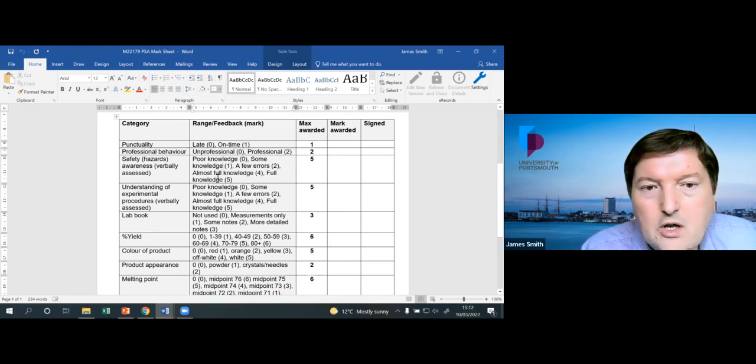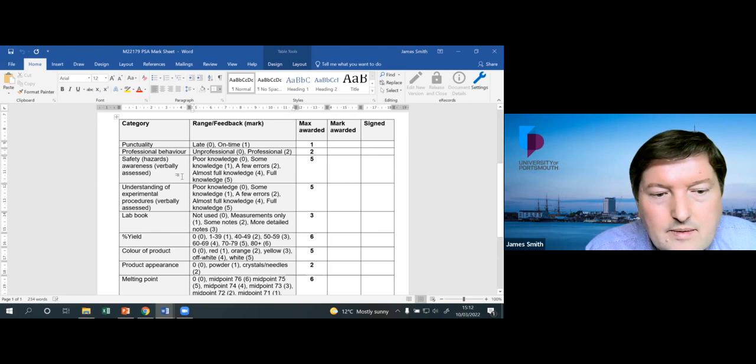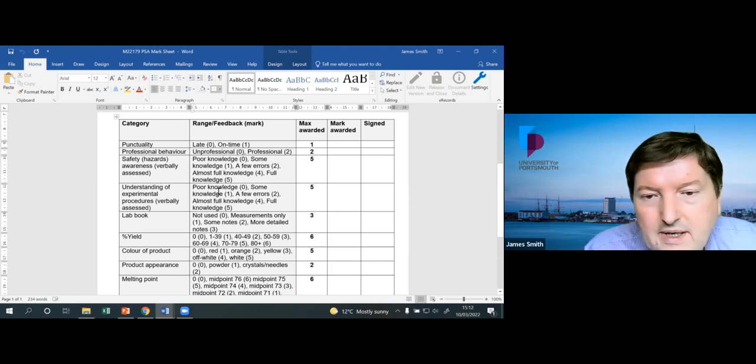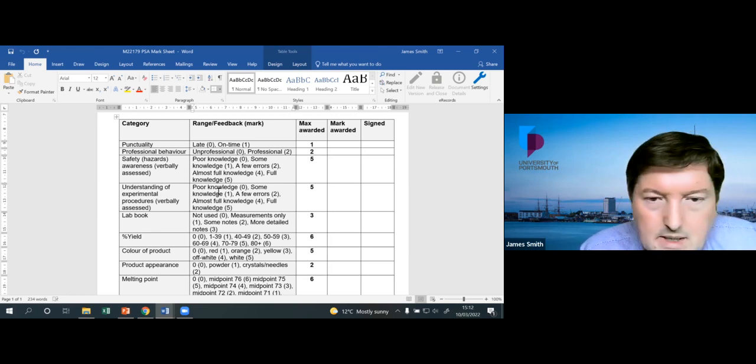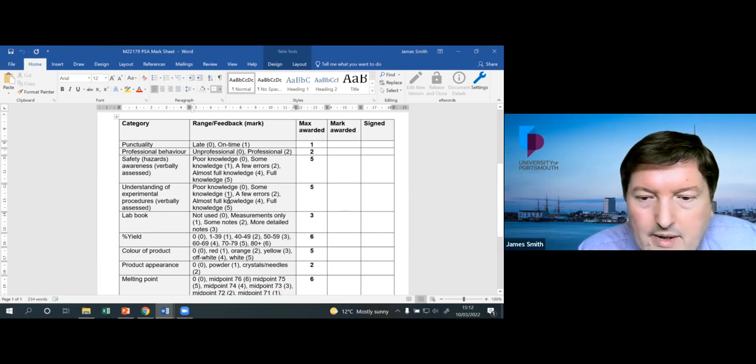Yeah. So look at the hazards. They're all on the PowerPoint, which I'll show you shortly, and they're also on the COSH form. So know the hazards associated with each chemical you're going to use. Sometimes people just say, oh, it's toxic. But sometimes they're not toxic. They're irritant or they're carcinogenic. So you need to know the level of detail we've told you on the PowerPoint and the COSH form.